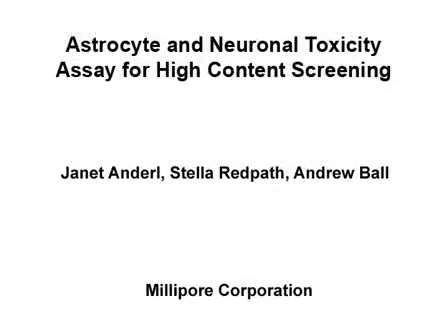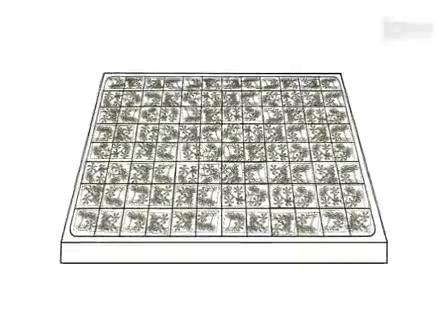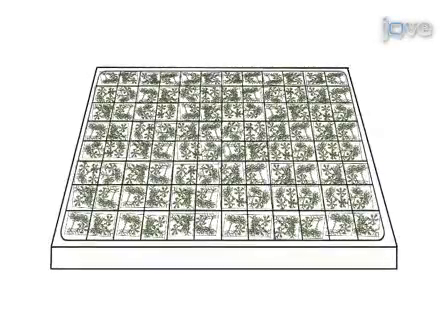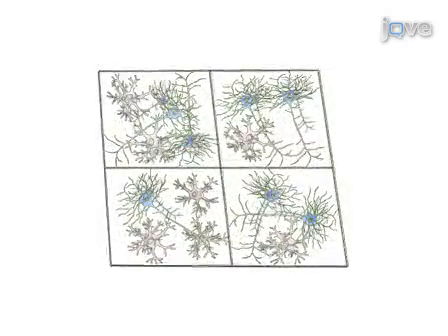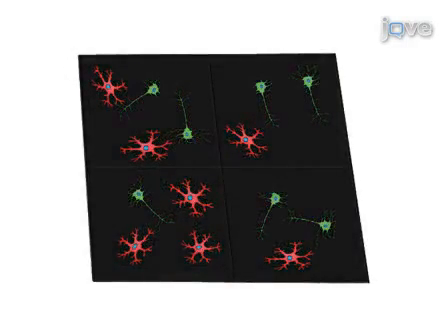High-content screening systems allow for a variety of morphological and cytological analysis to be performed simultaneously on many samples in parallel. In this video, neuron astrocyte co-cultures are prepared and seeded onto 96 well plates where they are treated with a neurotoxic agent and subjected to various neurotoxicity stains.